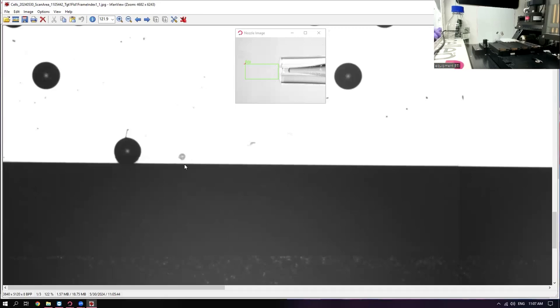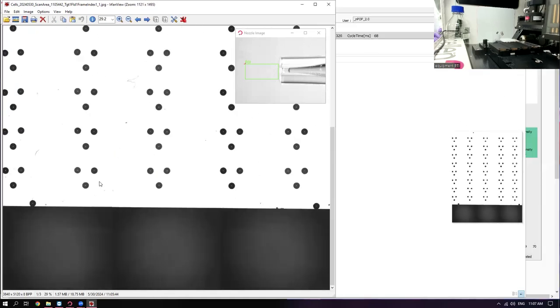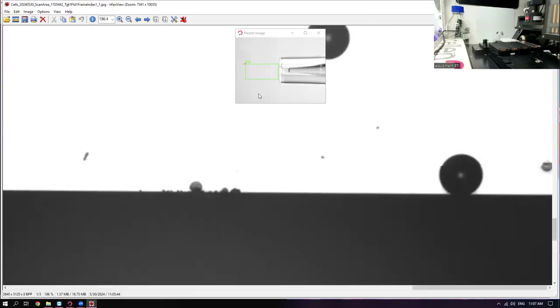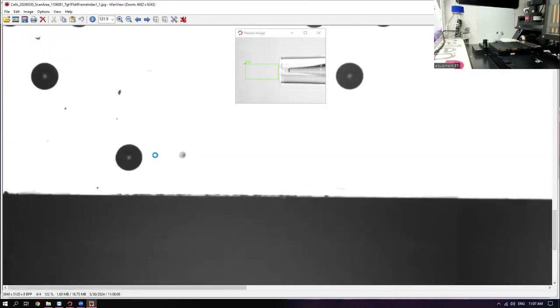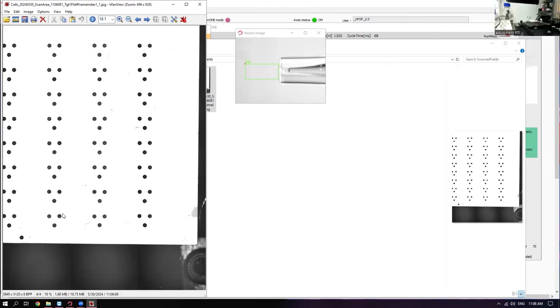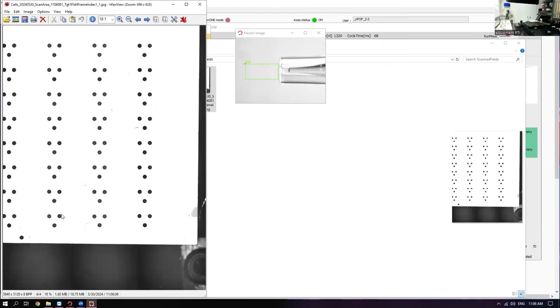And so essentially we see that, and you can see the single cell in here. Another one over here. It isn't as dry yet, so it's a little harder to see. You can see the cell there. But essentially we have QC that says for every cell, we do not see any droplets outside of the reaction droplet, right? And that's because all of the cells made it into those volumes. So we have this confirmation that we can go through and just make sure that that's the case. It's not always the case, but as long as you really take care to clean the nozzle, make sure you have good stable dispensing, make sure you're not off gassing, you're going to get this kind of behavior.